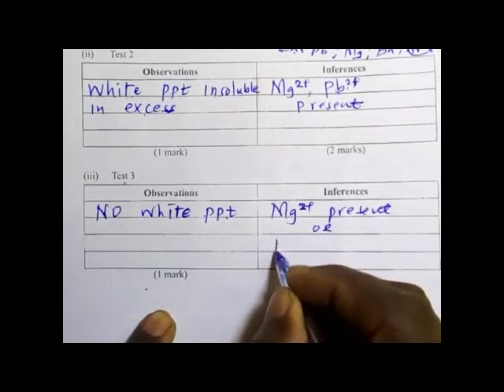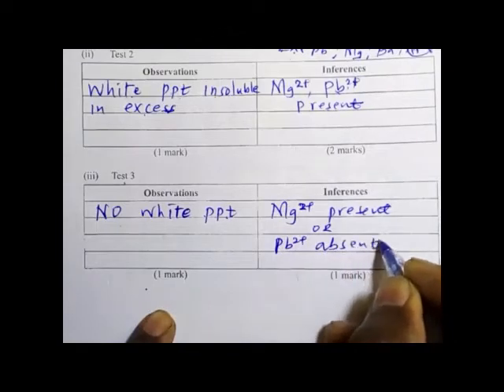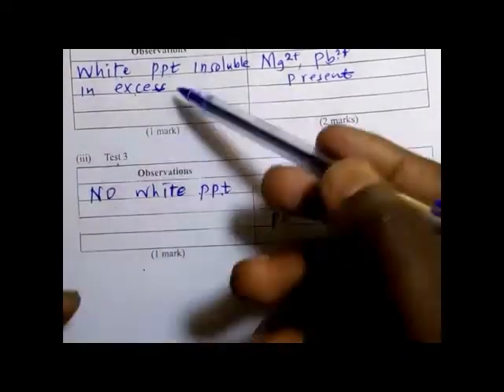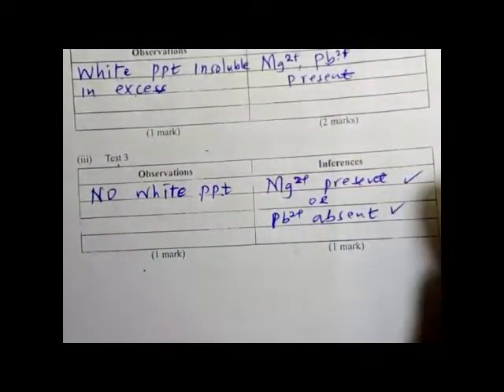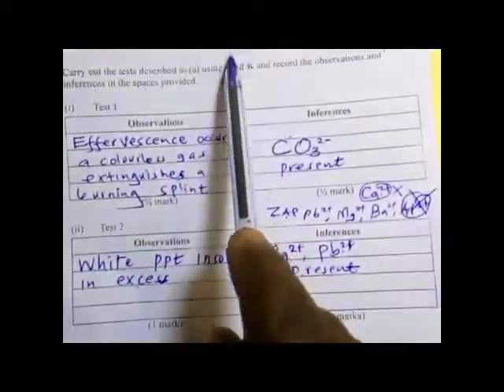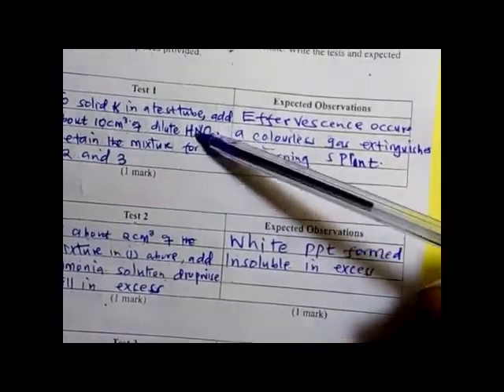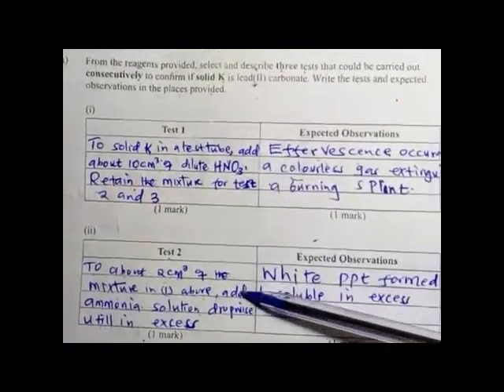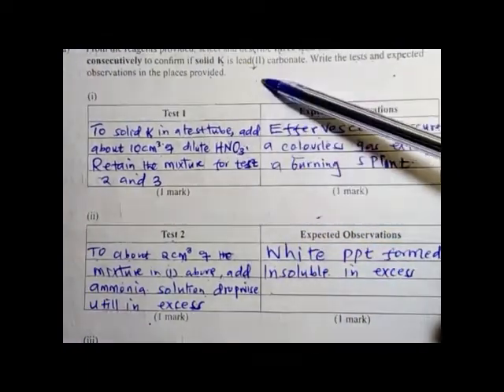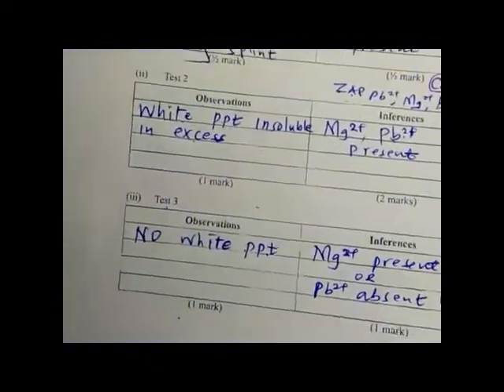Or you can say lead 2 positive was absent. It is acceptable. Was absent. So these are the observations on doing the experiment using the solid K. This one, the students were required to show that they know what happens when we have a carbonate. Let me take you to the last part of it.